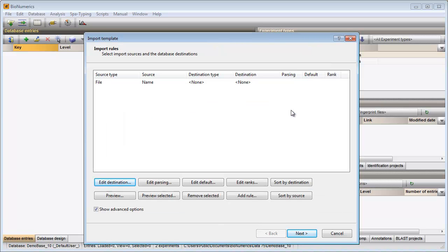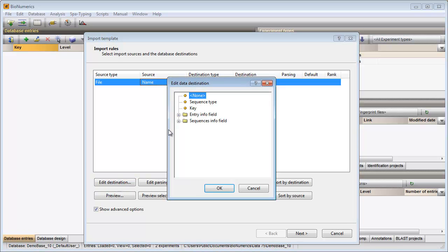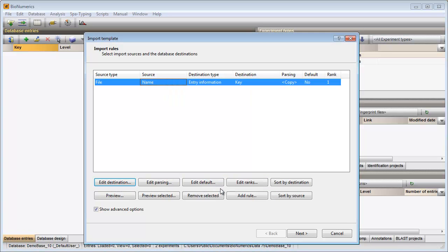The only source of information available in the newly created import template is the file name. I will link the file name to the BioNumerics key field. If I now press the preview button, I can check the rule that I have defined so far.